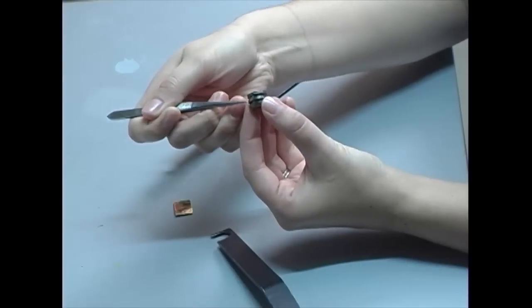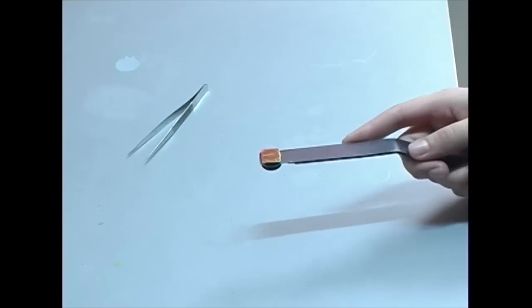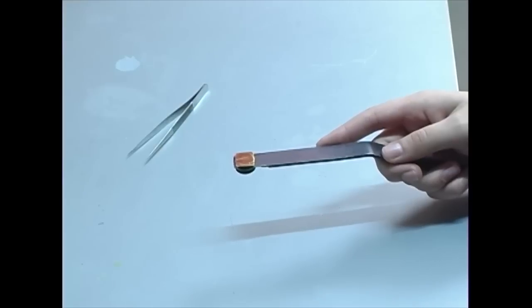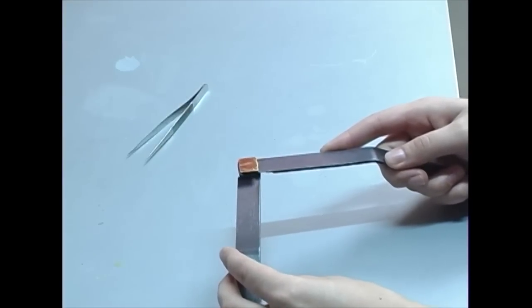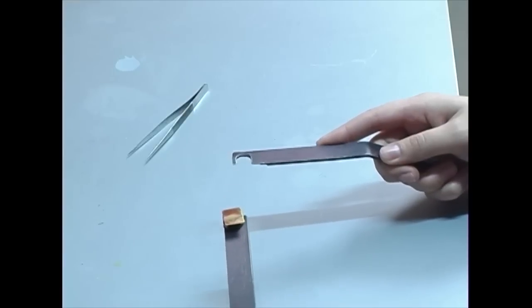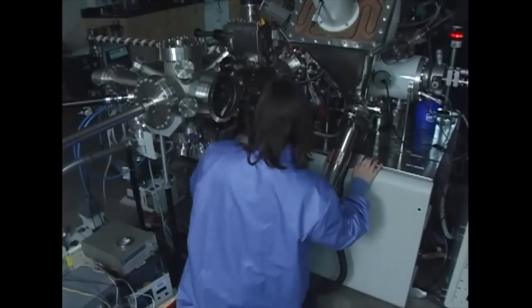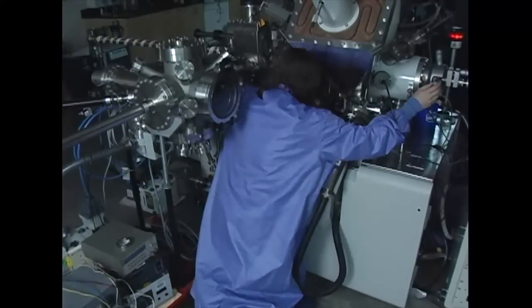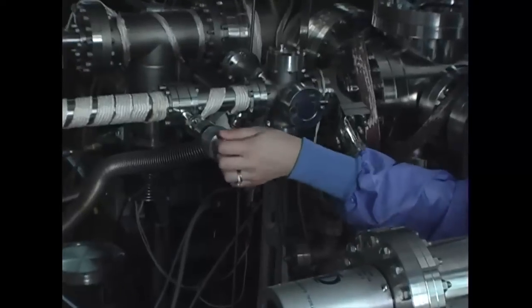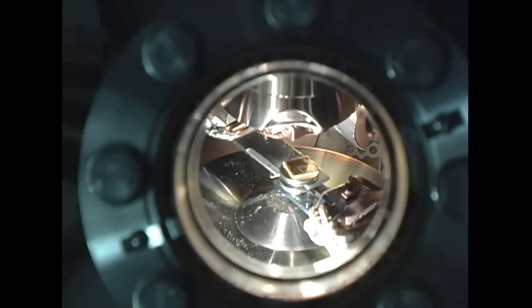The sample is mounted on a holder that has 2 grooves around its base. The manipulation tools have jaws that fit the holder. Using these tools, it is possible to transfer samples from section to section of the apparatus, even going around right-angled corners. The arm holding the sample and the analytical mount are controlled with wheels. During transfers, you have to manipulate both while watching through a viewport. The manipulator arm transfers the sample to the analysis chamber.